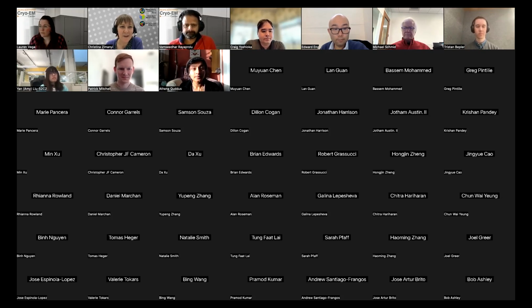Thanks, Craig. And Vamsi. Hi all, I'm a microscopist at PNCC. My role is basically talking to users, helping them with data collection and analysis. I've used a couple of particle pickers, and my view is very similar to what Craig said. I like to test and try everything that's available. My extensive experience has been, of course, with Topaz, and Topaz is amazing. So yeah, there you go.